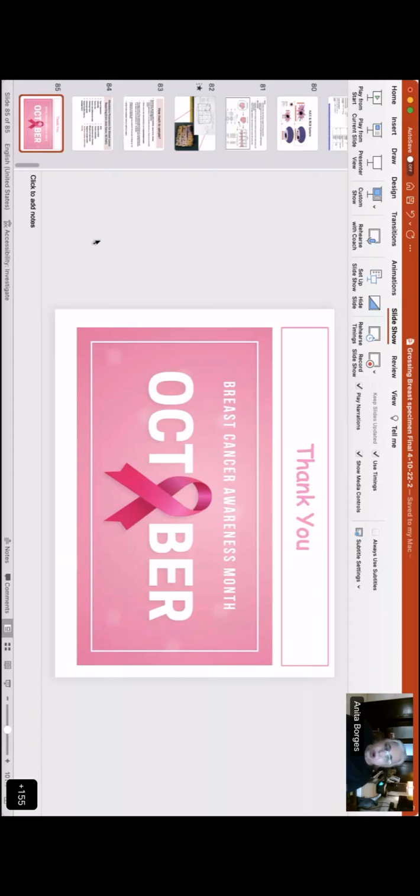Okay, so it is almost certain that if you have extensive intraductal carcinoma, you're going to get a positive margin, because the surgeon cannot feel the intraductal carcinoma with his finger, and is quite likely to excise a piece of tissue where there is no desmoplasia. So he's away from the infiltrative carcinoma, but he's very likely to cut through the intraductal component. And that is really, it isn't the fact that you have so much intraductal carcinoma that there may be multifocality or anything like that. It is about touch.